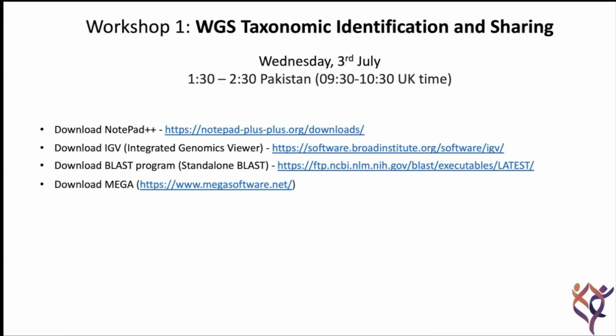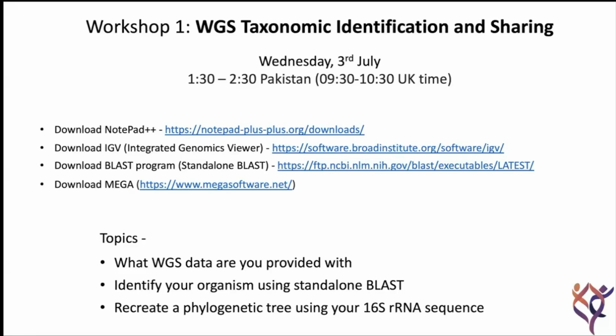All of these pieces of software are free to download, and we highly recommend that you do so. In order to follow this particular tutorial, you will need to download at least the BLAST program and ideally Mega as well. We want to give you the ability to identify your organism from the whole genome sequences, which is usually possible via the standalone BLAST program.